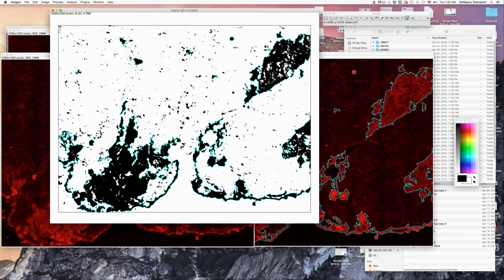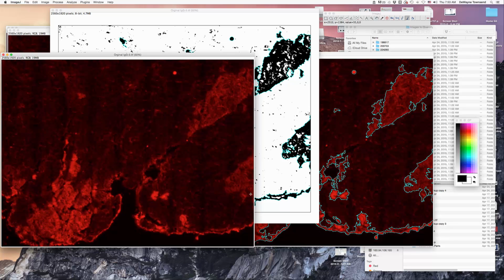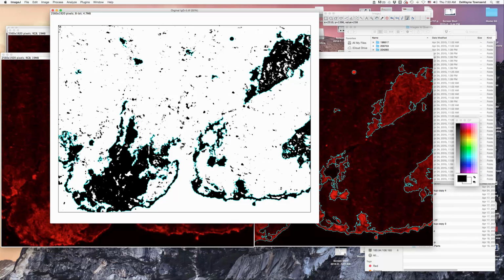We're going to do the same thing here. Draw this down so that it will then recognize all of this area as being a single lesion. And we can continue to reference back, and we can say, you know what, this probably needs to go as well. So we can just draw across here to blacken that in.